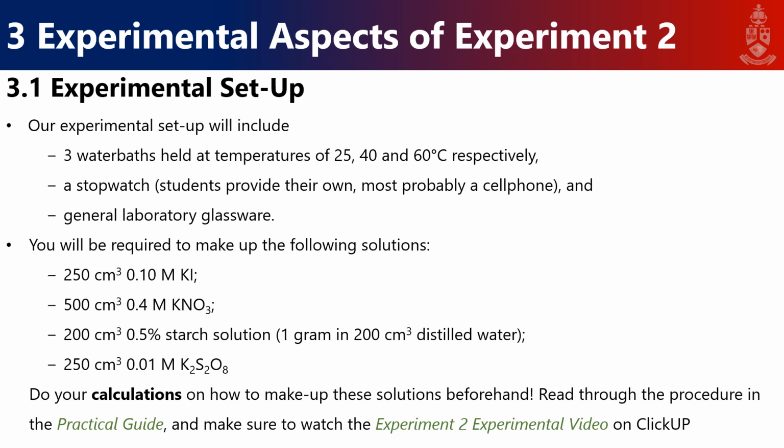You will be required to make up a number of solutions, so these are listed on this slide. Please do your calculations and double check that you know exactly how to make up your solutions, otherwise you waste too much time in the lab. Your tutors will also double check your calculations. Read through the procedure and the practical guide. Please be well prepared and make sure to watch your experimental video for this experiment.